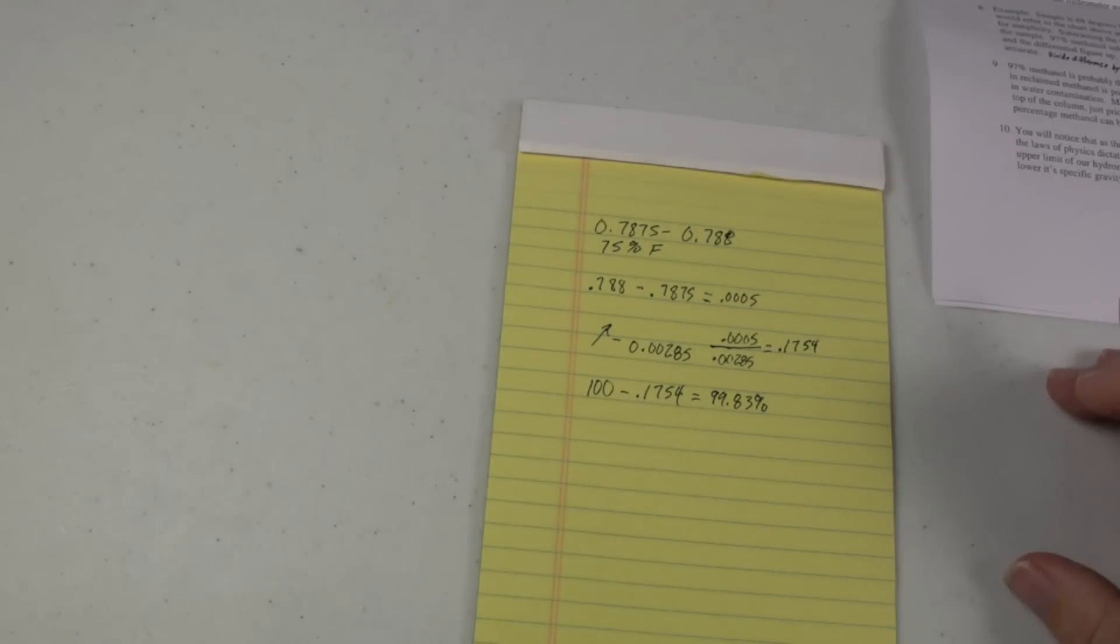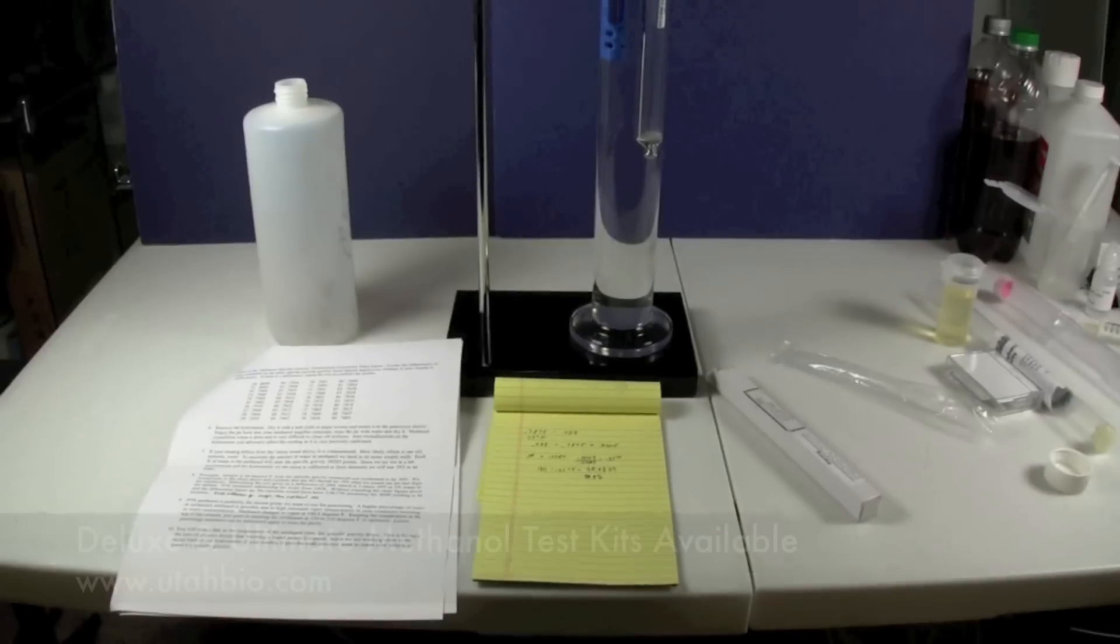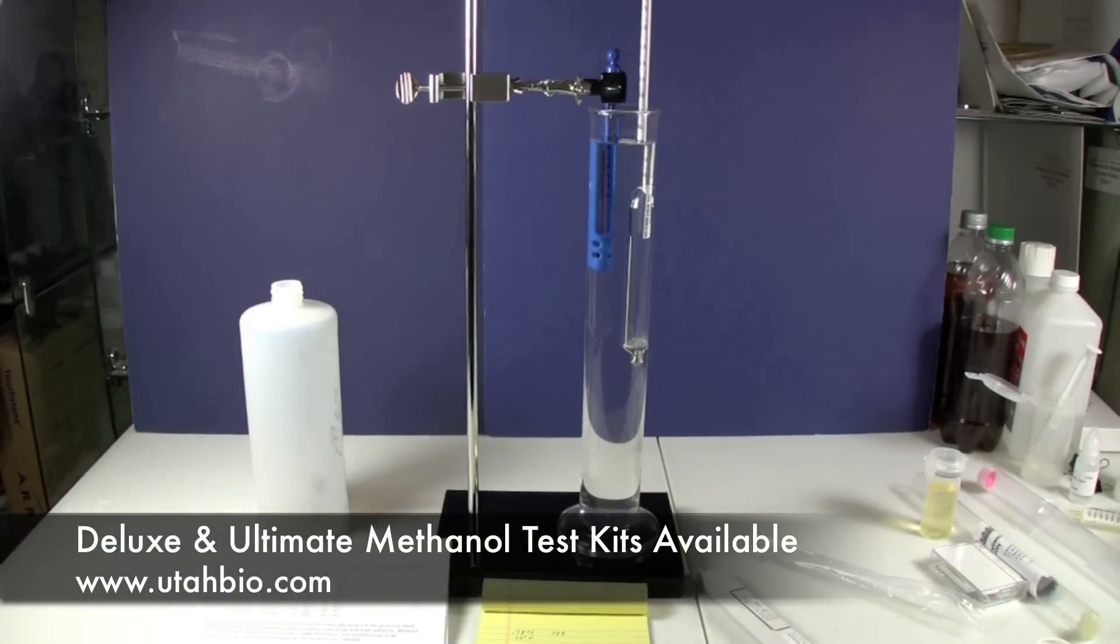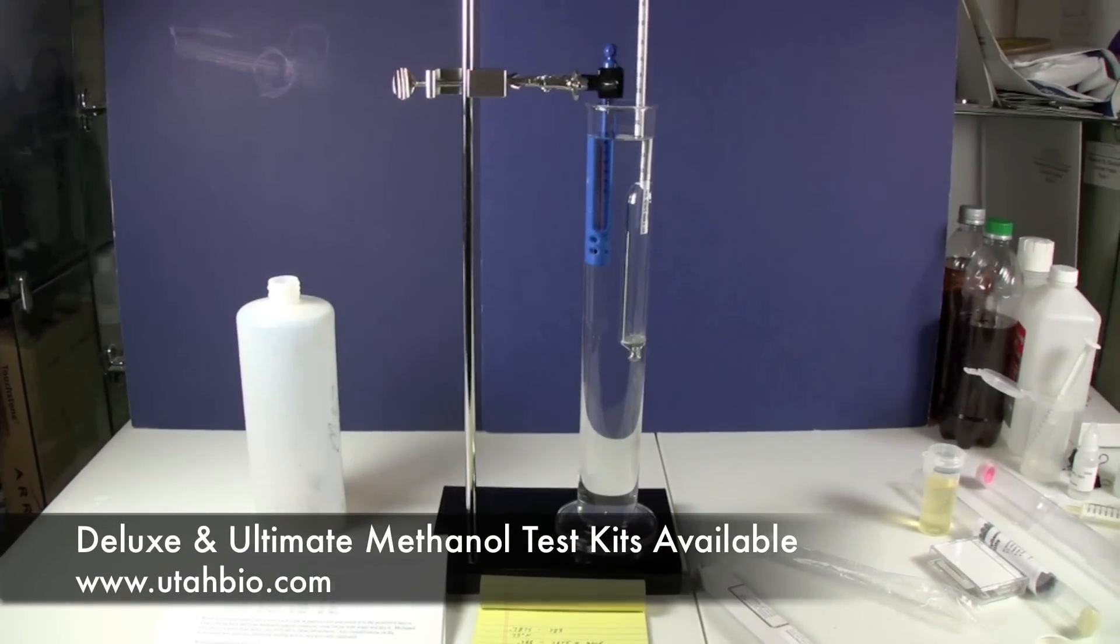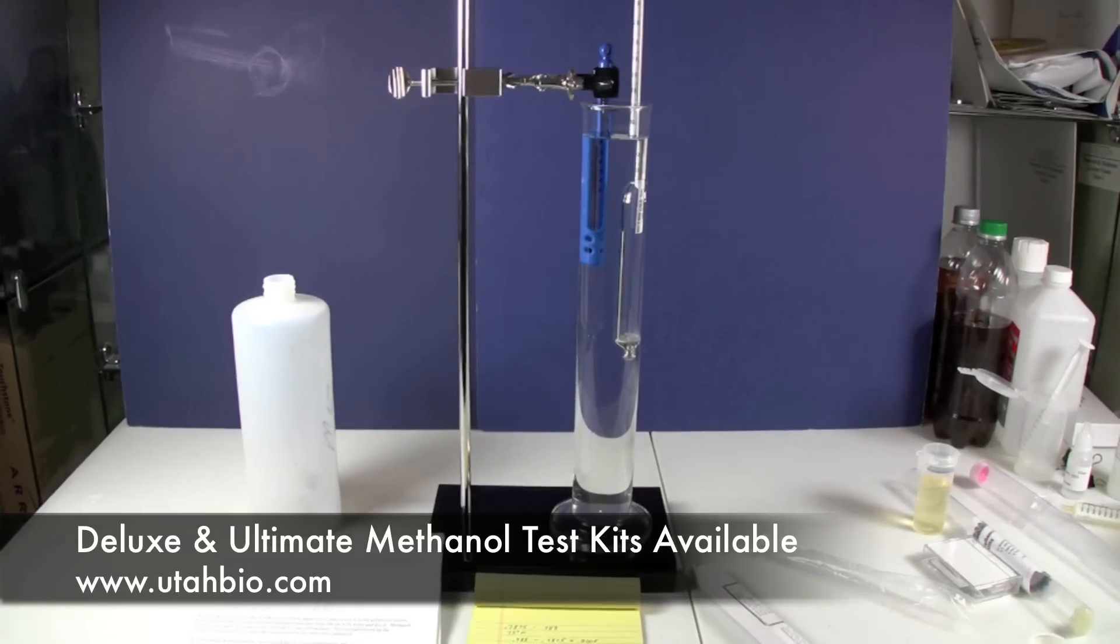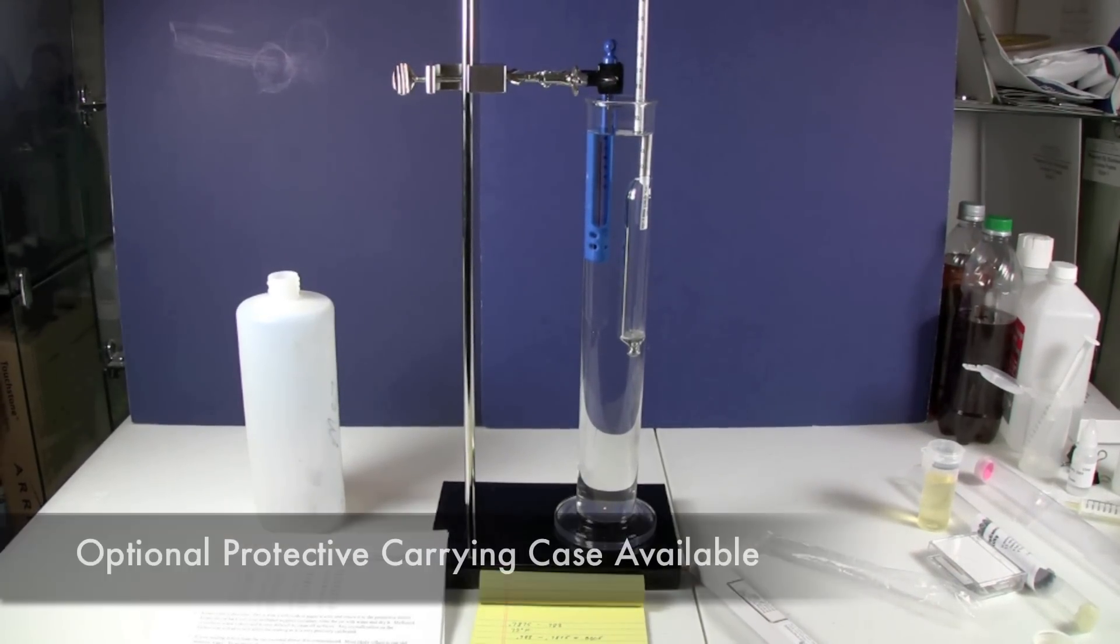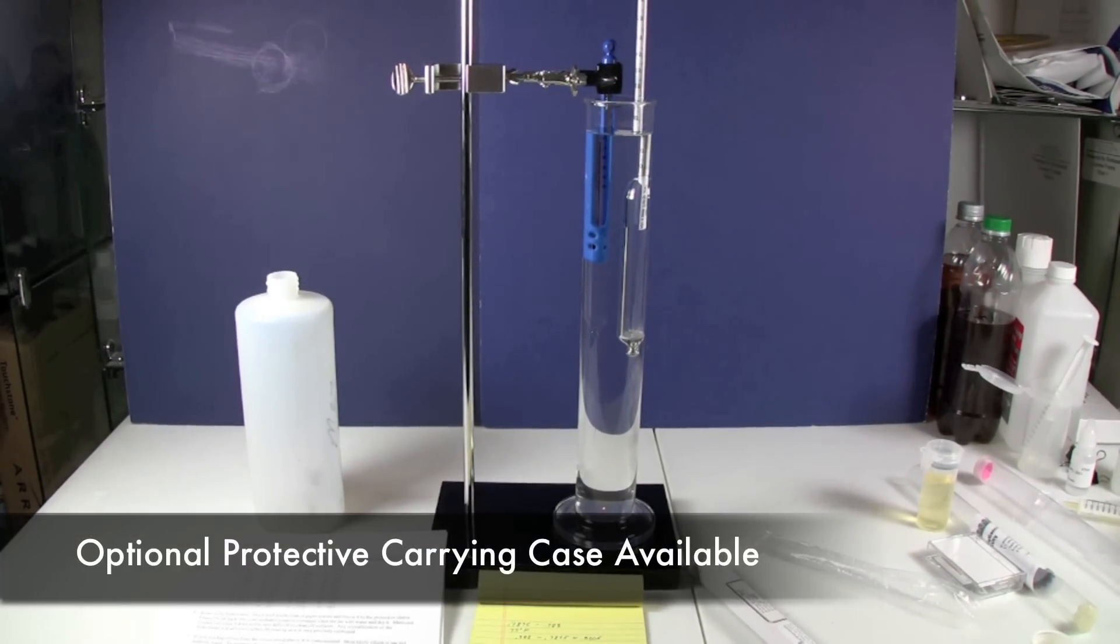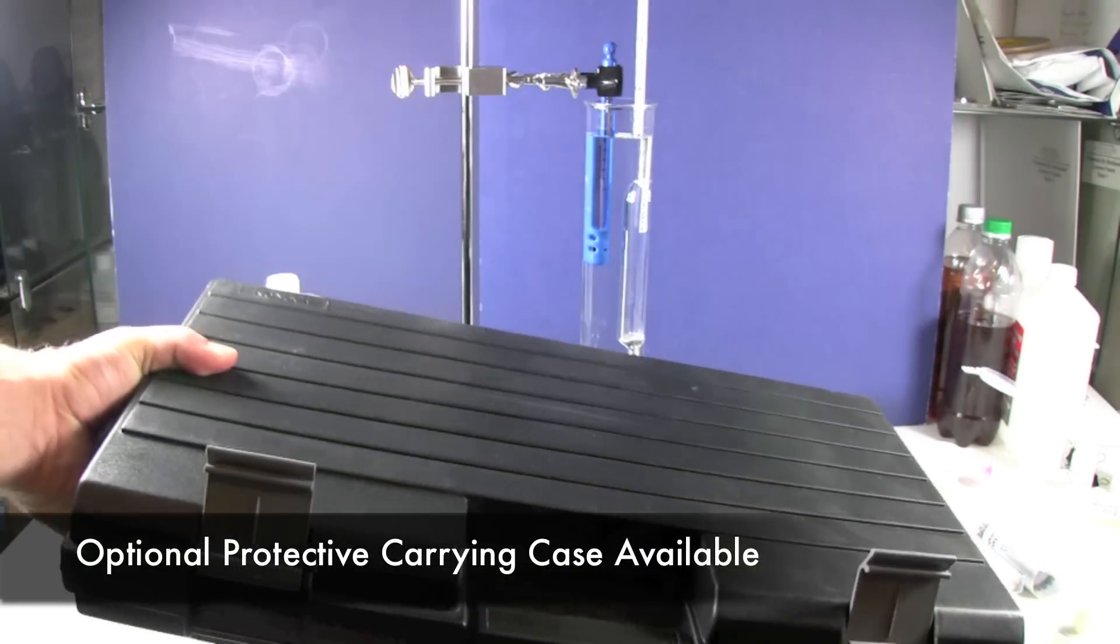But that's how you calculate methanol with a methanol test kit. You can learn more about methanol testing or take a look at our kits online at Utah Biodiesel Supply. Stop by, you can purchase the methanol test kit in deluxe form or the ultimate form. But also, we offer a handy case to store everything in, which we use with ours.